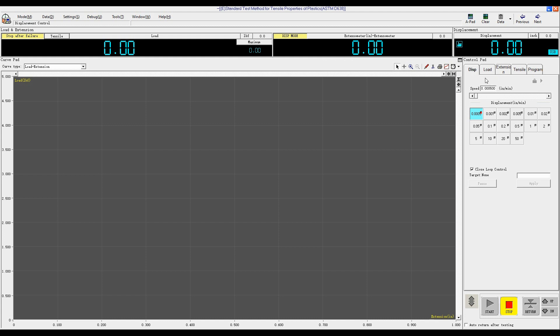And then choose the first displacement control. Select a test speed like 0.5 inch per minute, or 1 inch per minute. And then we click Start Test.